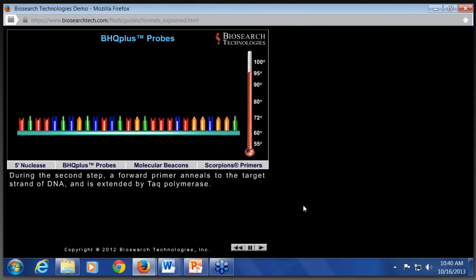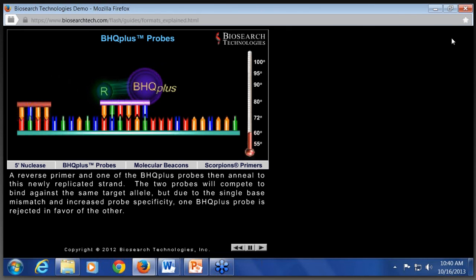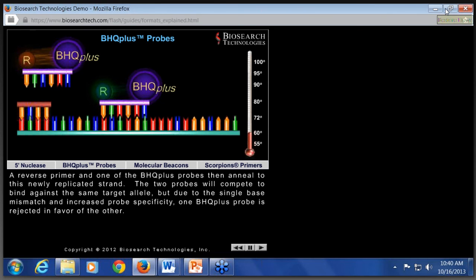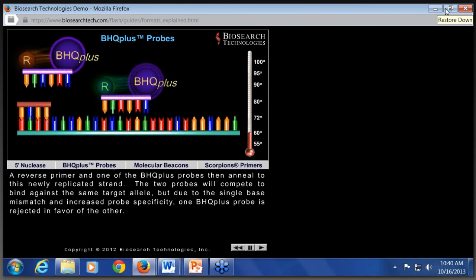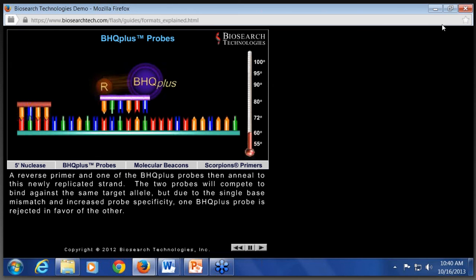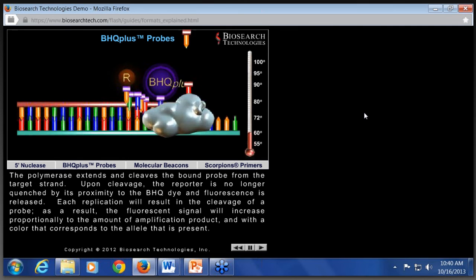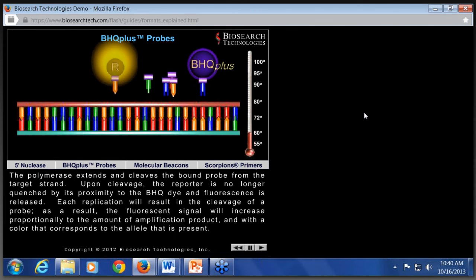Okay. I think that as well, the answer is to point people towards that as a really useful section of your website, those demonstration animations. So you can see that with the mismatch, it should only anneal to one or the other according to that mismatch.